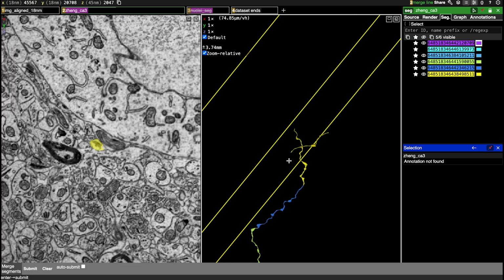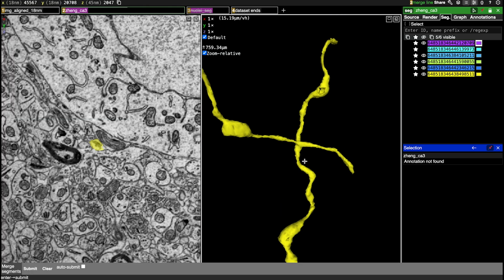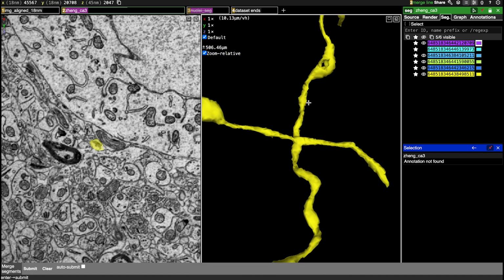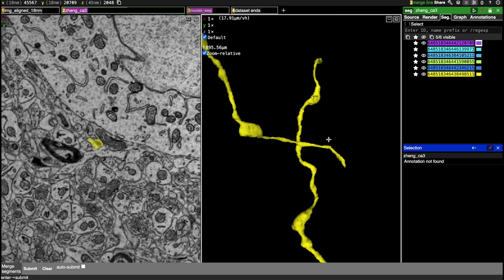All right, so here we have another little merger piece. This is going to be a different circumstance than what we had started with, so we're going to get rid of this merger like we did with the first one. But because this is not a starting segment, we don't need to also complete the branch ends on this segment. We can just get rid of it. So I'm going to do that now.